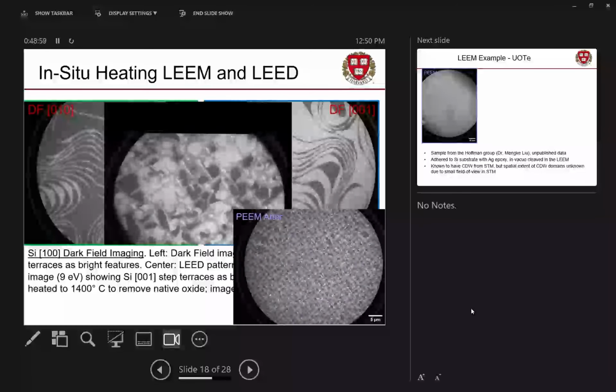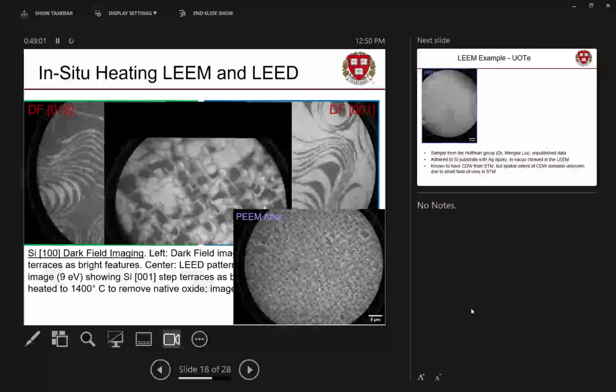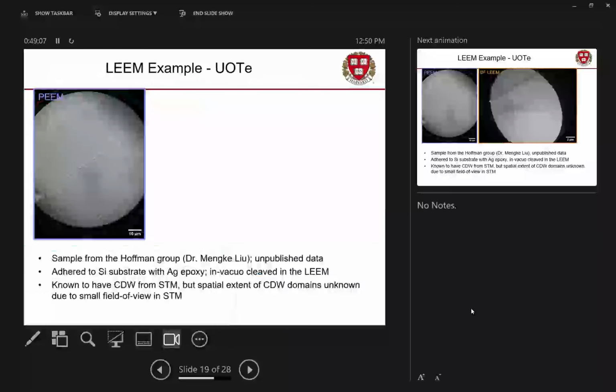Cool. So that's a heck of a lot of acronyms and a lot of microscopy. We're getting close to the end of this talk, but we're going to do just a little more. I'm going to do an example of a real material and a real problem that was really solved using LEEM. This is a material from the Hoffman Group at Harvard.